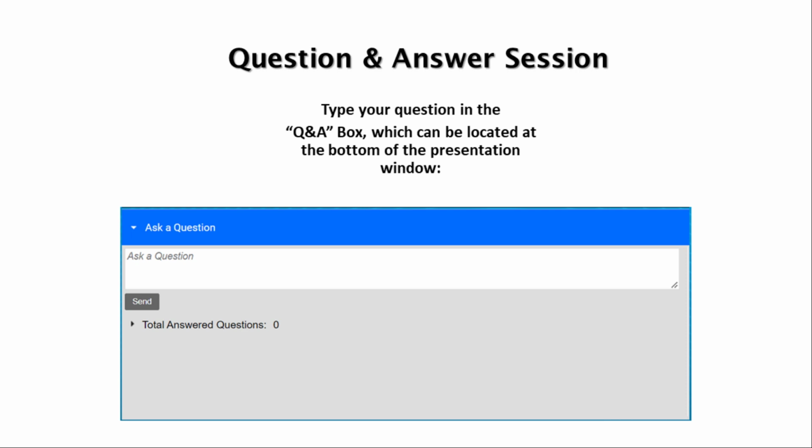Now, another question that did just pop up. This scientist has the Waters I-Class system, and they would like to know if the Halo 1.5 millimeter works with that system. Oh, sure. So it definitely would work.